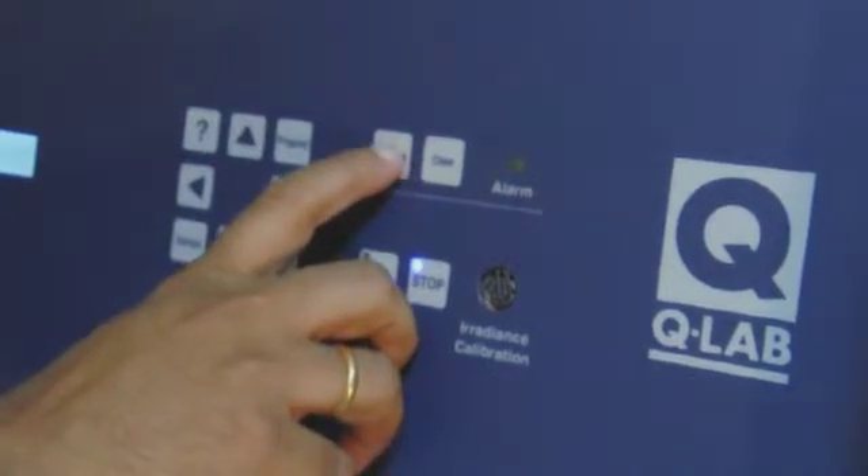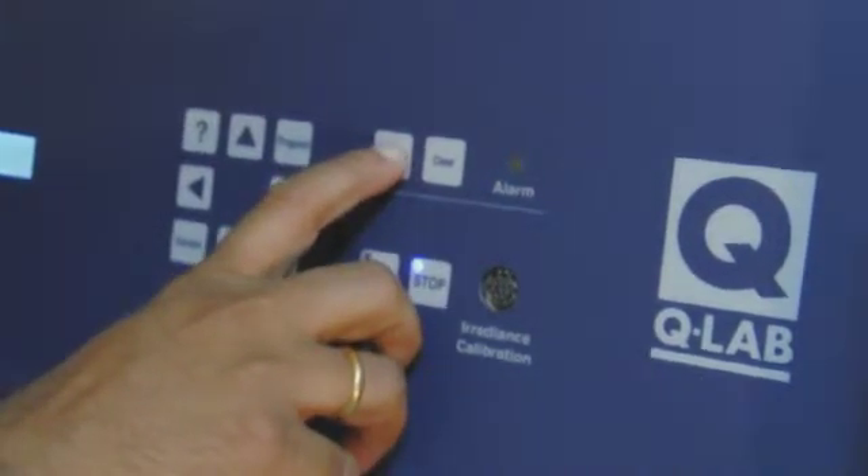The Q.U.V. Accelerated Weathering Tester is the simplest, most reliable, and easiest to use weathering tester available. With thousands of testers in use worldwide, it is the world's most widely used weathering tester.